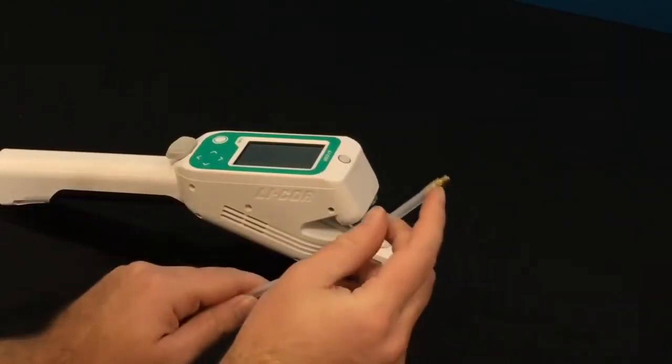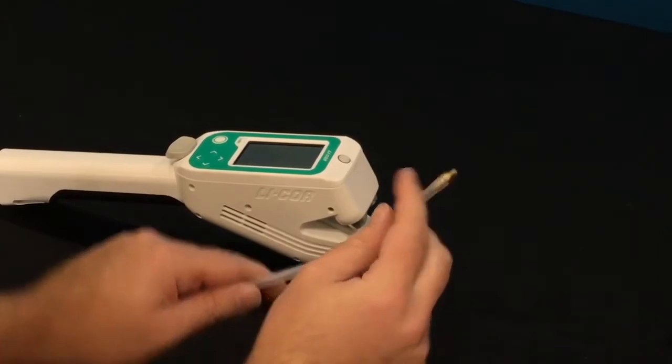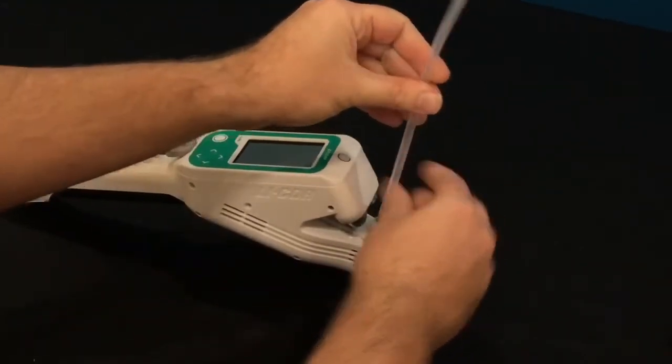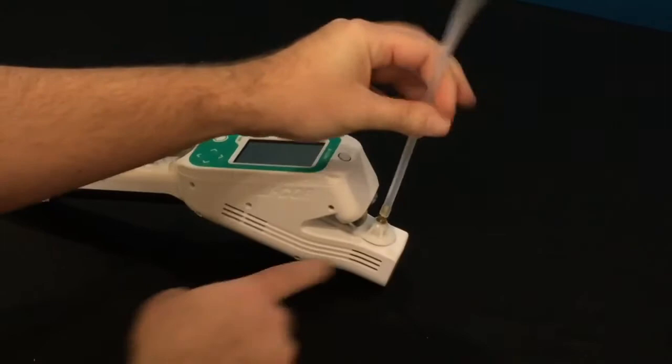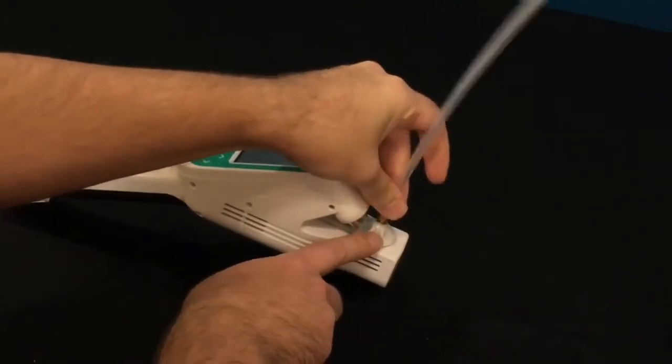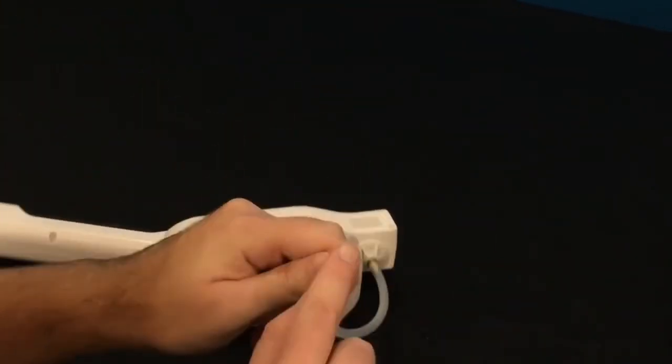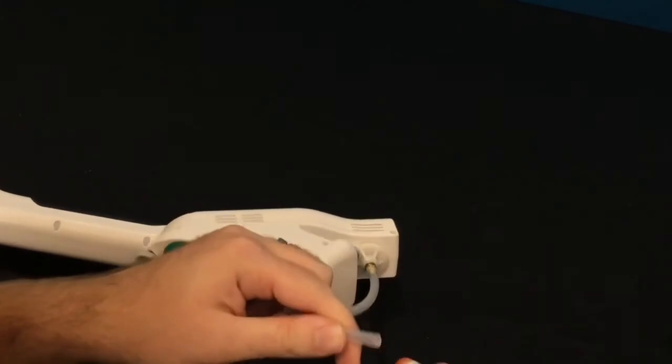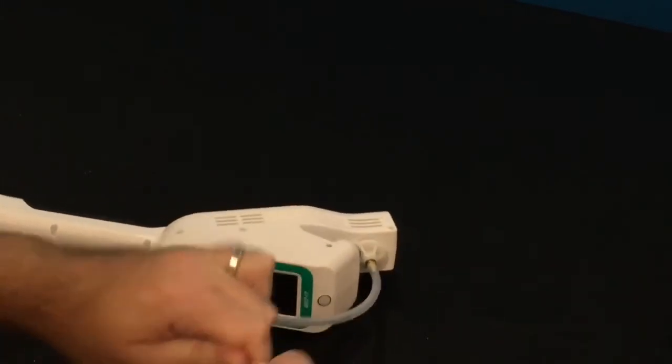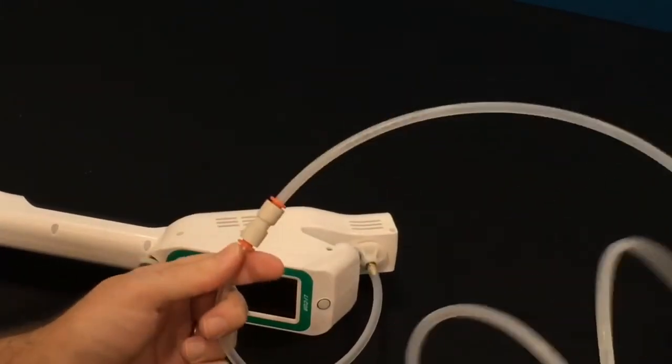Now you'll take the 1032 hose barb that came with the instrument and connect it to the calibration clamp. Then connect this end of the tubing with a quick connect to your tank or dew point generator.